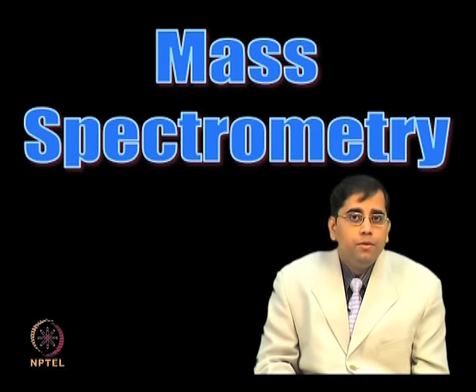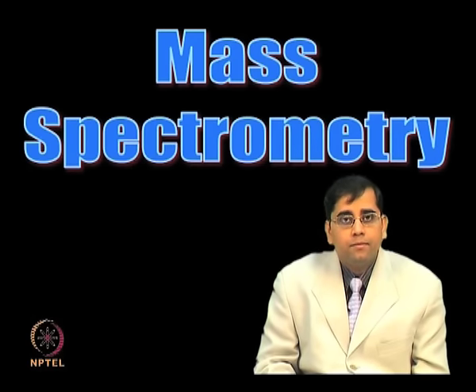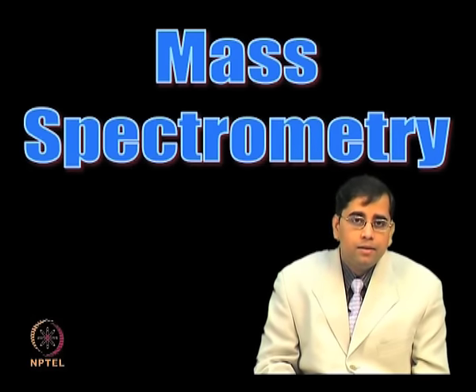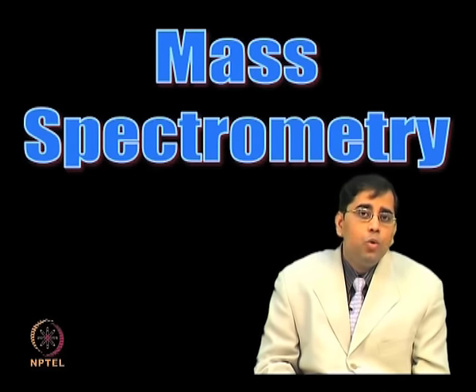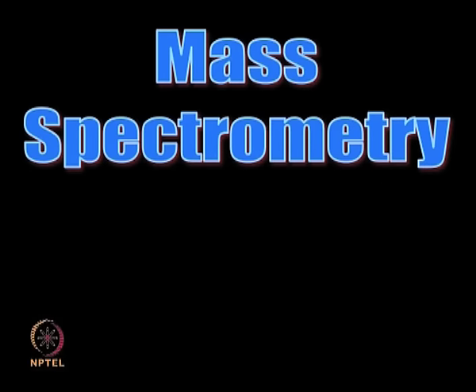In this module, we will discuss basic concepts of mass spectrometry, ionization sources, mass analyzers, hybrid MS configurations and quantitative proteomic techniques such as SILAC and iTRAQ.